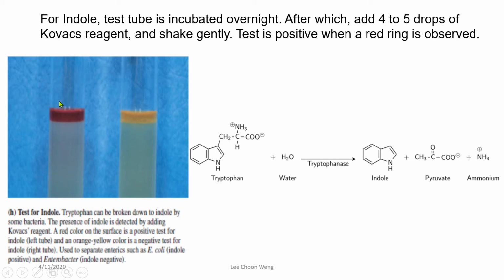So this is useful to separate Escherichia coli, which is indole positive, versus other bacteria, for example Enterobacter, which is indole negative.